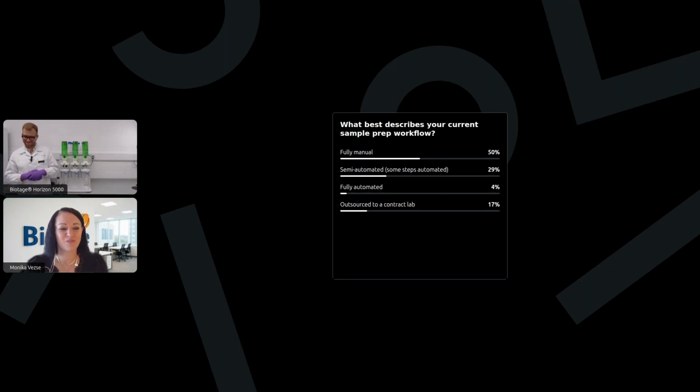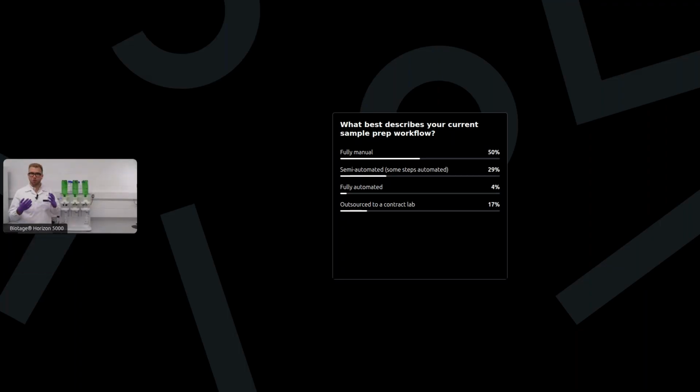Take it away. So good morning and good afternoon to everyone who's joined us. And as was mentioned, we're introducing our Horizon 5000 system here. Now, many of you will be either running labs or doing the actual analysis in the lab for environmental samples, and quite possibly analyzing things from SVOCs to pharmaceuticals, perhaps hormones, PAHs, or any other environmental contaminants.